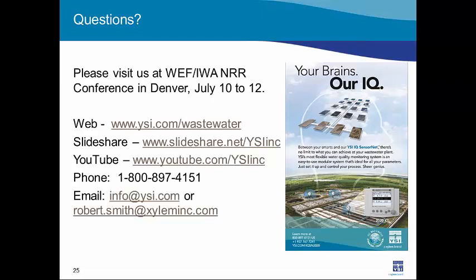At least it's less expensive to purchase. However, if you need the most reliable measurement with the least effort, no matter what, you're probably going to want to spend the extra money and get the optical nitrate probe. It's especially going to be most effective at measuring low nitrate concentrations.